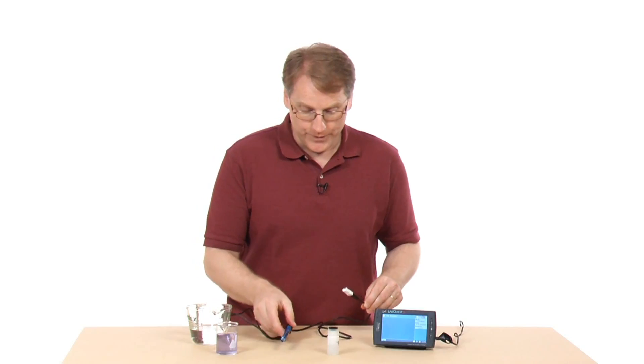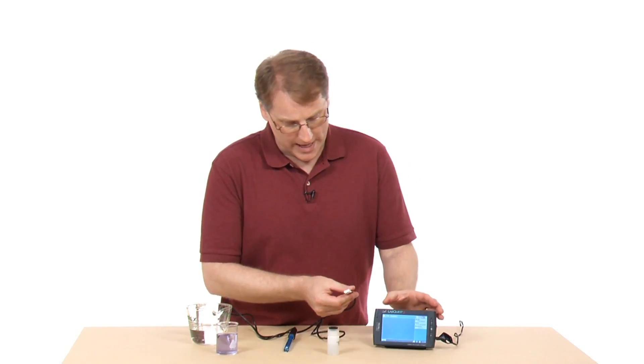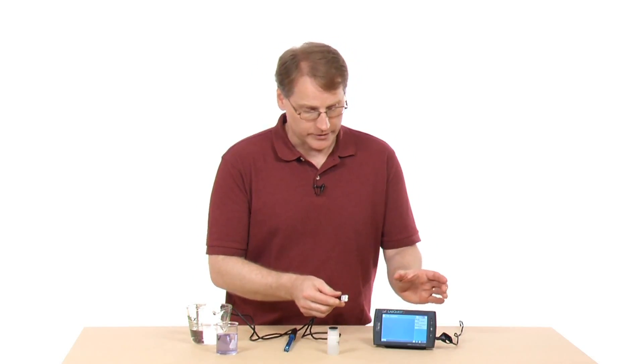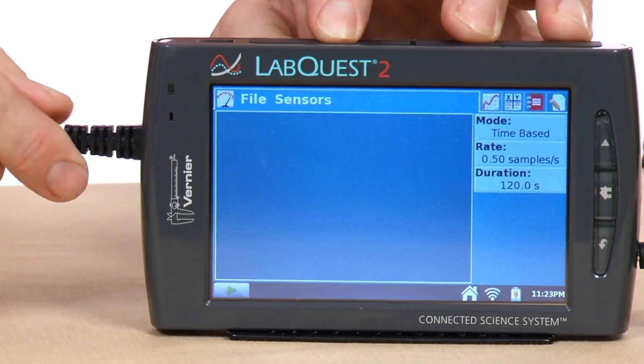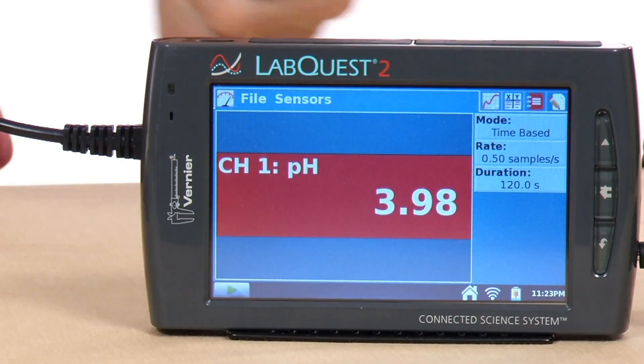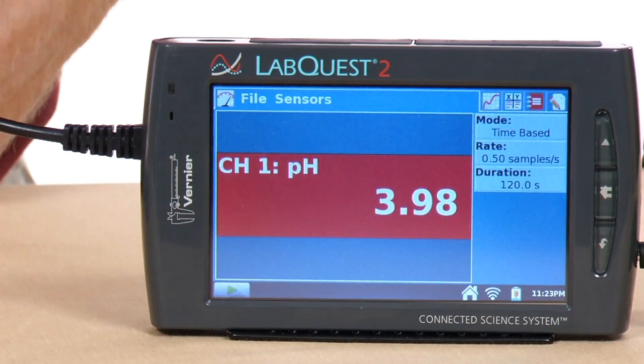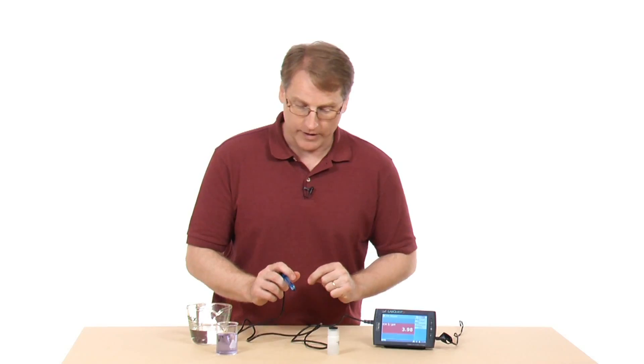The first thing I need to do is plug this into my LabQuest. It's an analog sensor, so it goes into one of the analog ports here. When I plug it in, I get my meter reading here, and it's close to the 4 where I had it in the solution before.